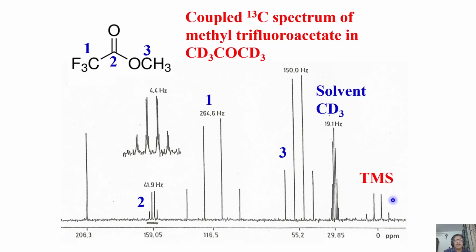Then this is solvent because we have CD3COCD3. Then we have various isotopomers of that: CD2HCOCD3, CDH2COCD3, all possible combinations we can think of. And this is going to be a complex multiplicity pattern for the solvent. That's also fine. Then what is this peak? This is the solvent CD3 group. This is the CO of the solvent. Very simple, right? All the peaks could be assigned now.